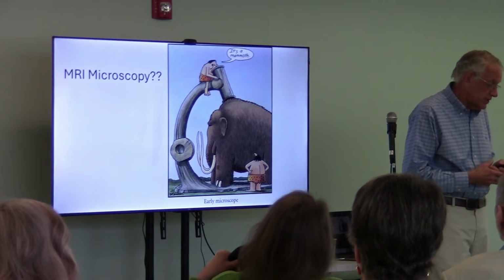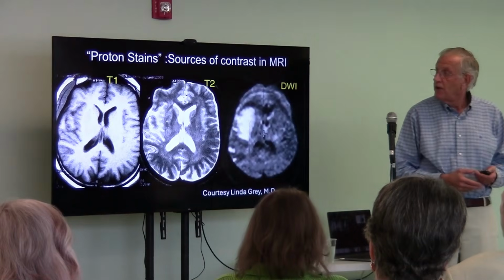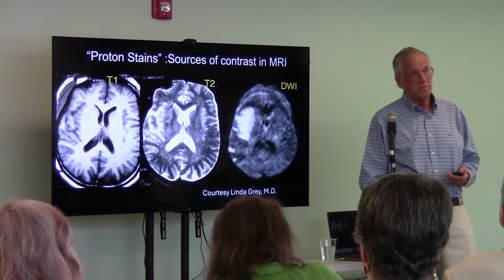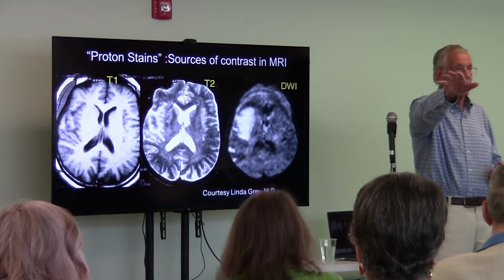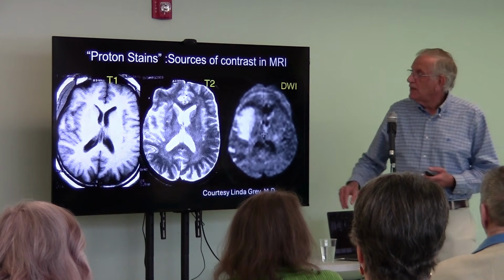So how do we use this? Wait, can you go back one slide? Yes, sir. So on the left side, T1, you excite the cells, and you're measuring the rate of decay of that. It's measuring the rate of energy transfer out into the world. Right. So what is different with T2? What are you measuring differently?